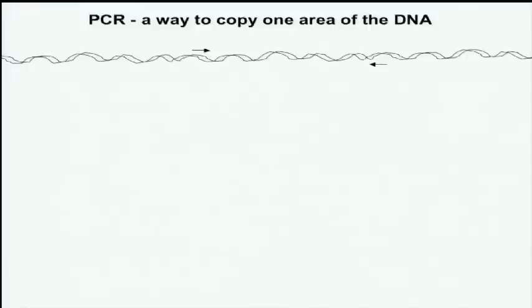So let's say that you had DNA samples from people, and you wanted to separate them by size using a gel. What would you do? On my next slide, I'm going to show you the first step that you would do. What you would do is you would take all the DNA in the sample, which remember, every human cell has 3 billion letters from their mom, 3 billion letters from the dad. And we're only usually analyzing a very small amount of that DNA.